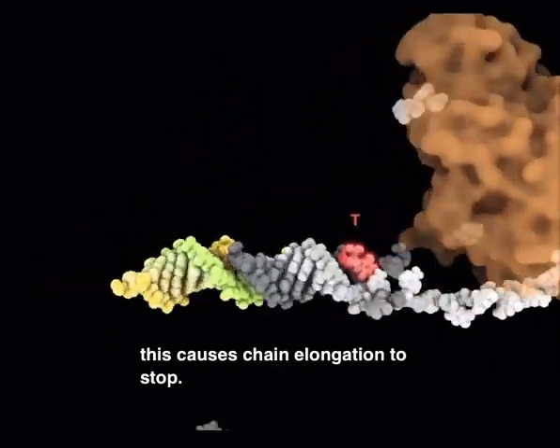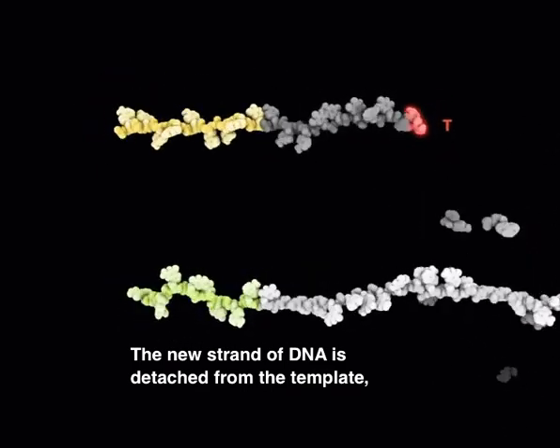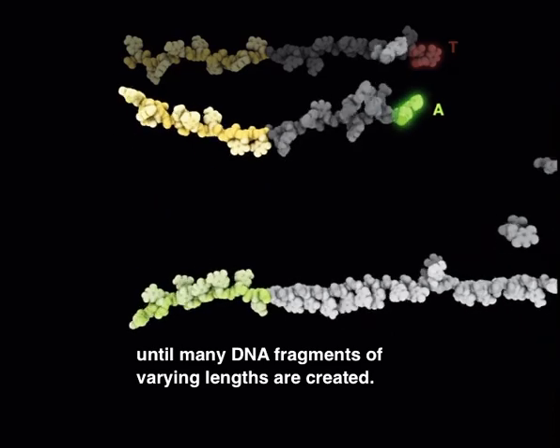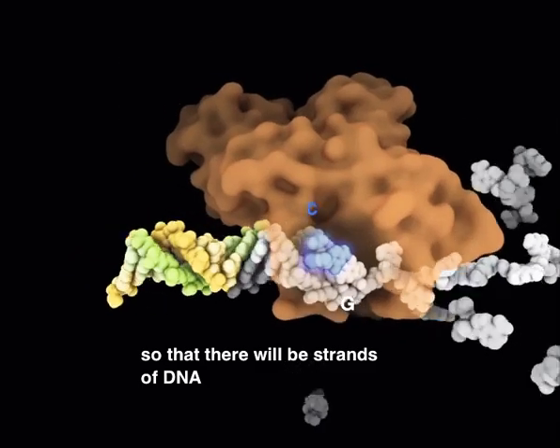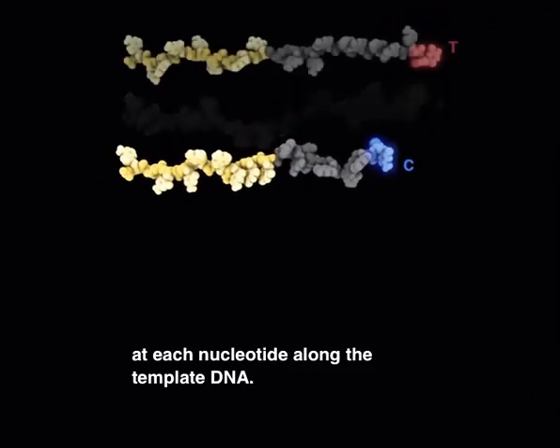to stop. The new strand of DNA is detached from the template, and the process is repeated over and over again until many DNA fragments of varying lengths are created. The reaction is repeated enough times so that there will be strands of DNA that incorporated a fluorescent nucleotide at each nucleotide along the template DNA.